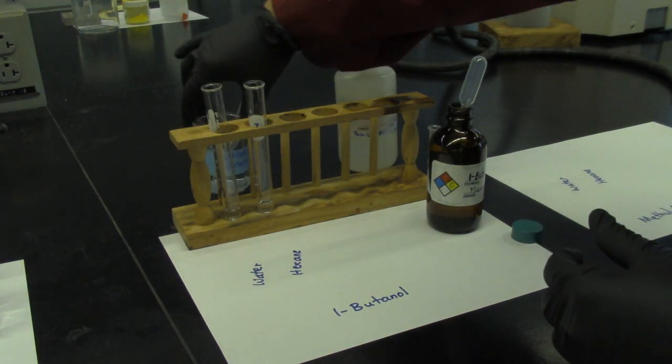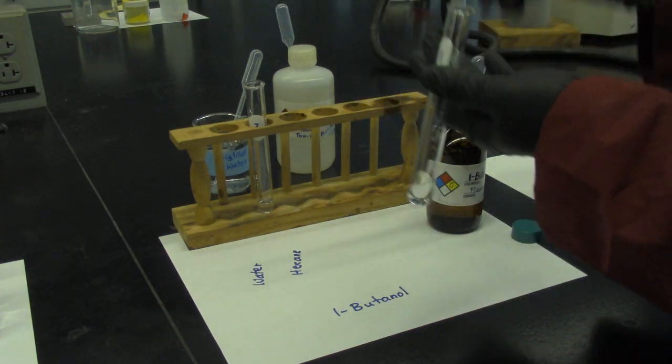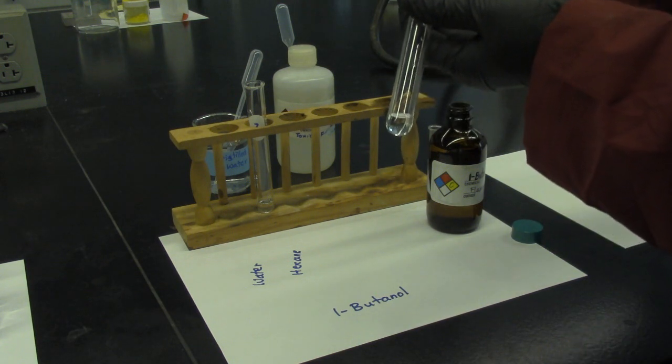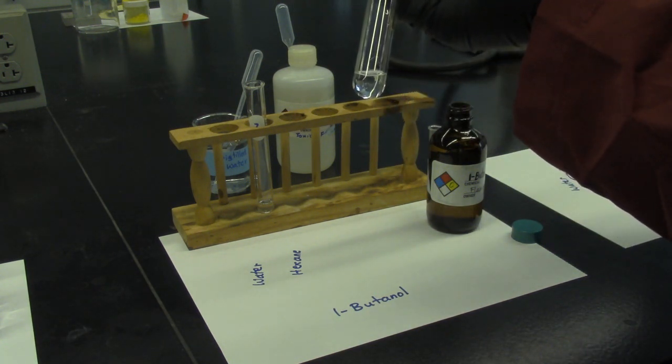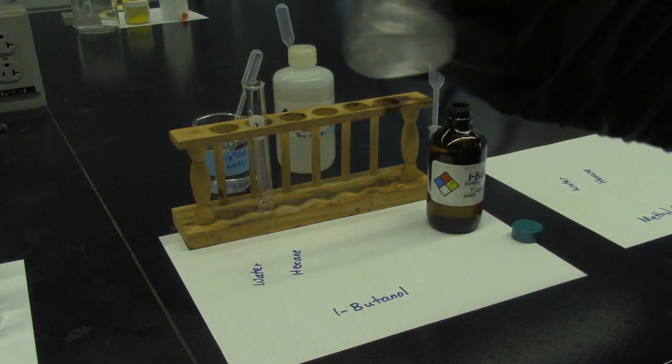So moving on to butanol. First test tube, water, a few drops of butanol, 1, 2, 3, 4, 5. Shake it.